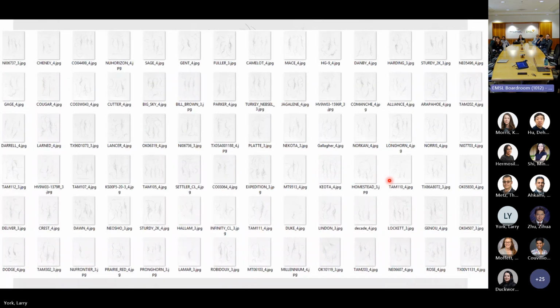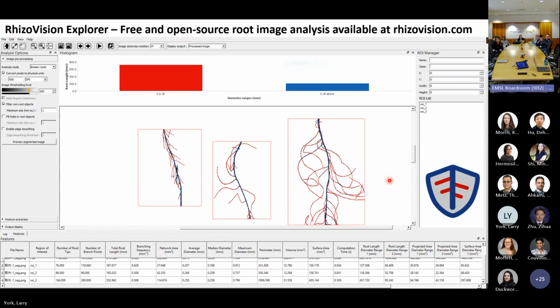And a lot of people have all these images and need a way to analyze them. I had been involved with several projects to do root image analysis, and eventually I decided that the computer scientists never really got the needs of the users right. So, viewing myself as the primary user of this software, while I was at Noble, where I had pretty good levels of core funding, which was really nice, we were able to develop software that really does what it says. It just works.